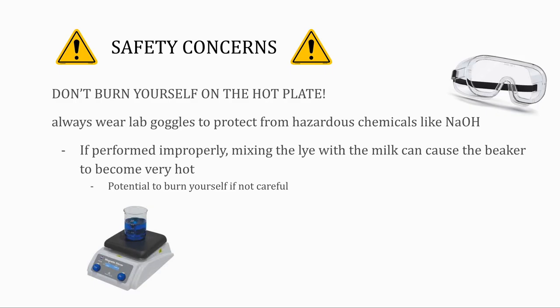Before we start on our lab, here are a few safety concerns. Please don't burn yourself on the hot plate. Always remember to wear your lab goggles to protect yourself from hazardous chemicals like NaOH, which we will be using in this soap lab. If performed improperly, mixing the lye with the milk can actually cause the beaker to become very hot, which is why we put it in water in order to keep the temperature minimal. And because of that, remember to protect yourself from getting burnt.